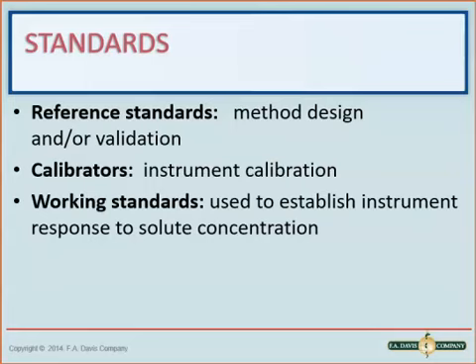Say you have a set of 5 working standards, each standard would be of a different level. Maybe you have a level 1, level 2, all the way up to a level 5, and each level would be increasing in concentration. That's another way to test and establish your instrument, to make sure everything's running correctly.